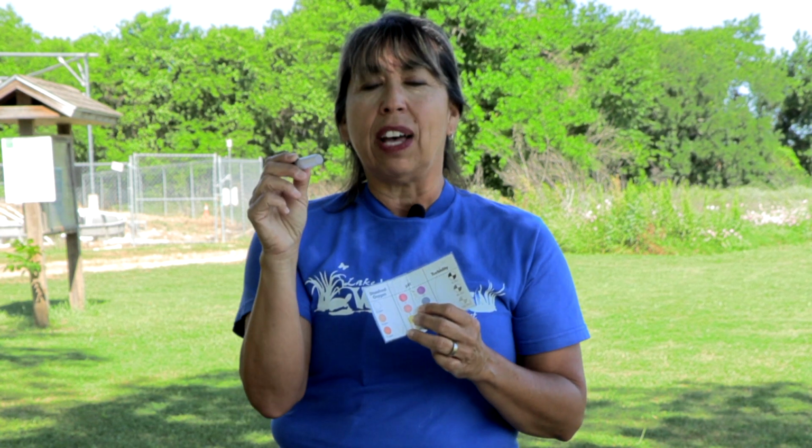So we want to make sure that our water isn't real turbid. That's why we take a turbidity test. We want to make sure that it's not too acidic or too alkaline, that it's right in the middle, because that's how organisms grow. And then we want to make sure that it does have dissolved oxygen.